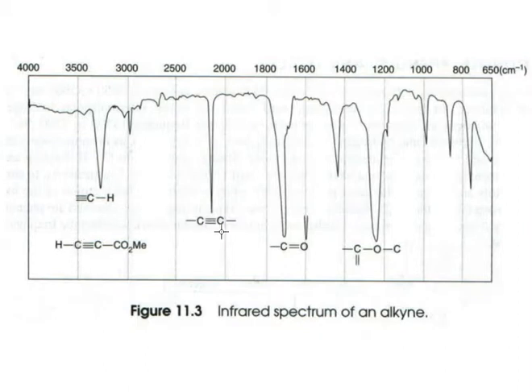The next peak we encounter is a peak for the carbon-carbon triple bond stretch. We note that this peak is sharp and relatively big. And that's because if you examine the molecule, there is a relatively larger polarity to it. The ester group is very electron withdrawing, pulls electrons compared to hydrogen. And that creates a polarity, a significant polarity in the CC triple bond. Now when the CC triple bond stretches, that polarity gets even larger. So there's a relatively larger change in polarity as the CC triple bond stretches and compresses back and forth. Hence, the stretching motion of our CC triple bond here is fairly large.